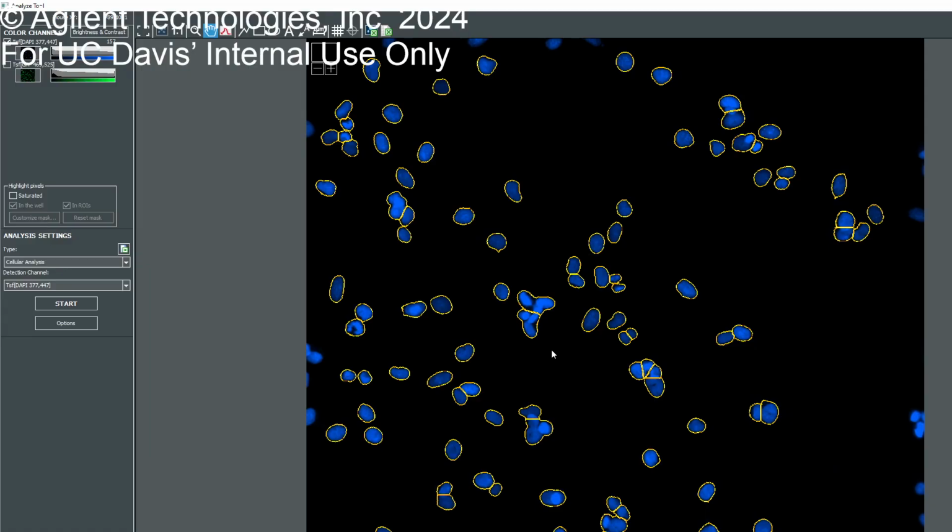It's going up, right? If it's too far down, you're probably going to count these cells as one. If you are too close up like this, then you're also miscalculating because the whole peak is not being a part of that, and there are also going to be some nuclei like this that you're missing out on. Makes sense? In this exact example, if you look at the profile of this cell, it's 15,000 RFUs versus this one is 39,000 RFUs. So if you set your threshold to be above 20,000, you're going to miss everything below 20,000.